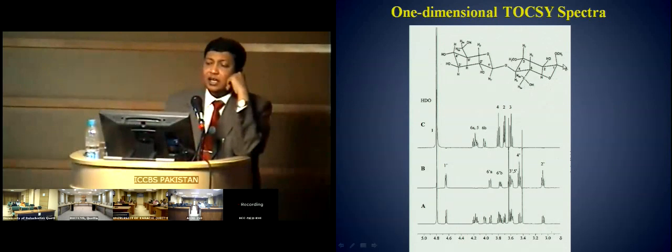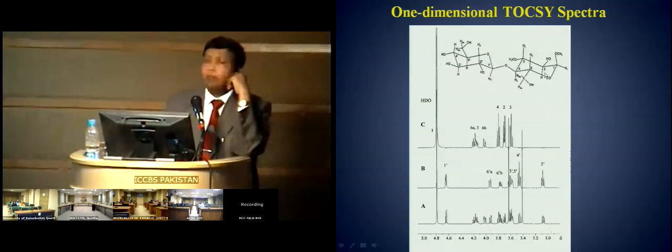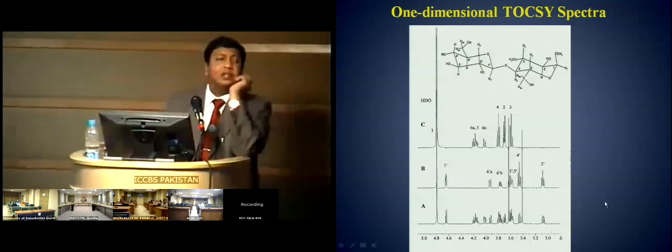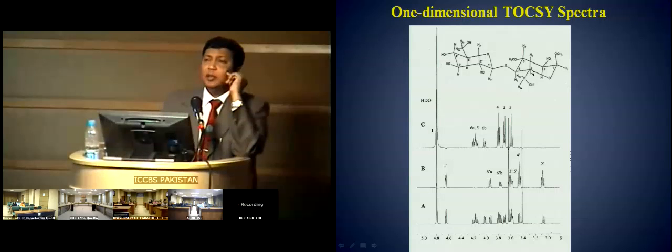As a result, they are all almost on the same chemical shift, but their coupling is operational, and that coupling is appearing as a fine structure in your NMR spectrum.